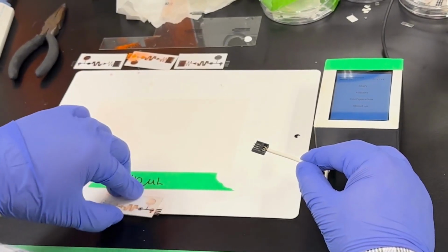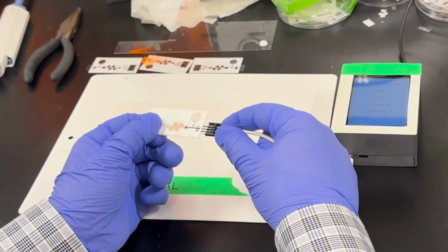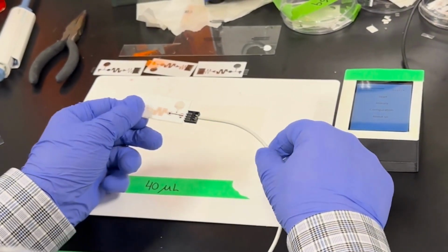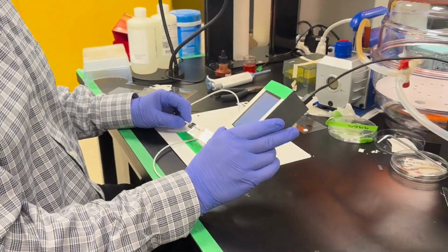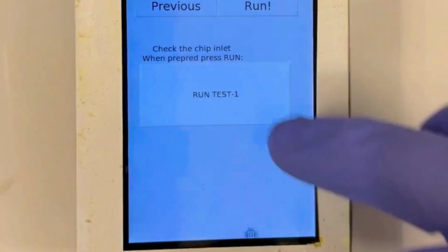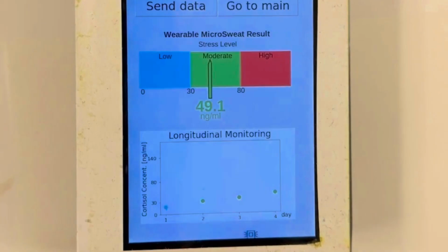The microfluidic biosensor assay is a device that uses tiny channels and chambers to perform complex biochemical reactions on a small scale. When a biological sample is introduced into the assay, it reacts with various chemicals and produces a signal that is detected by the electrode sensor. Our system utilizes an electrode sensor connected to a Raspberry Pi Zero via a GPIO port, which acts as a powerful computing platform for analyzing the data. The electrode sensor is a cutting-edge technology that allows for precise measurement of cortisol levels in biological samples.